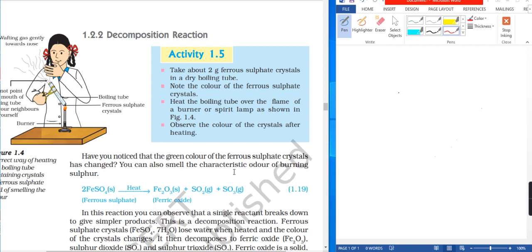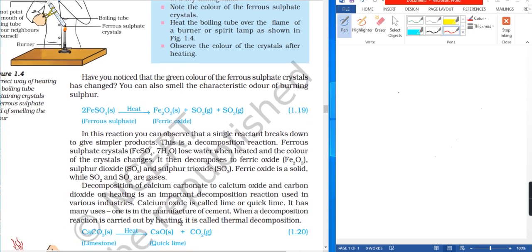You can also smell the characteristic odor of burning sulphur. The color of the ferrous sulphate crystals changes. Crystal means solid.